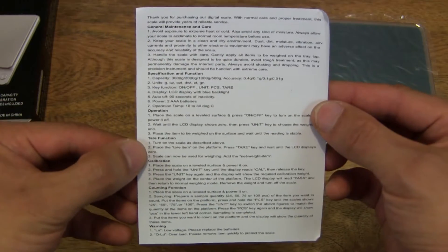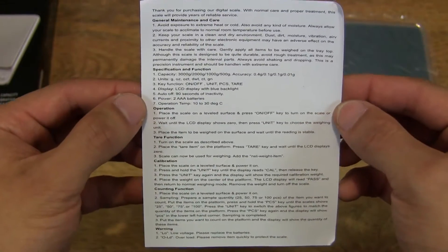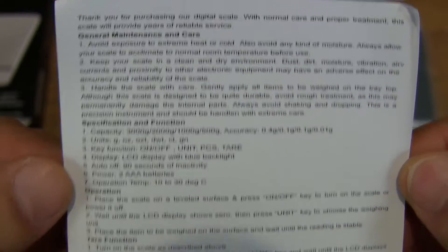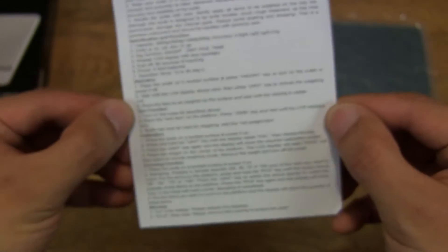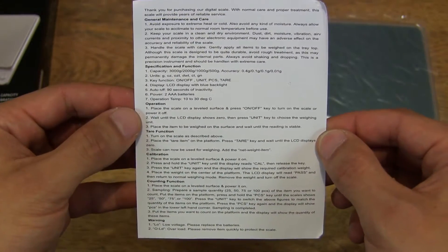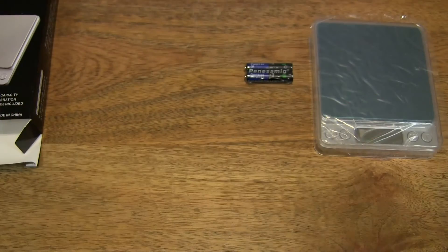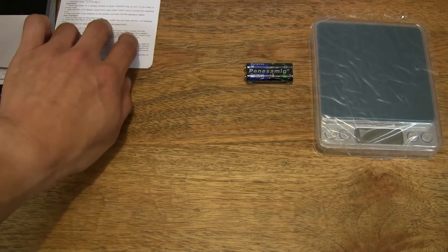And then take a look at this paper or leaflet here. It does have very tiny print. It is a user manual leaflet detailing the use and general maintenance of the digital scale, printed in English on one side and Chinese on the other. Let's go ahead and set that to one side.